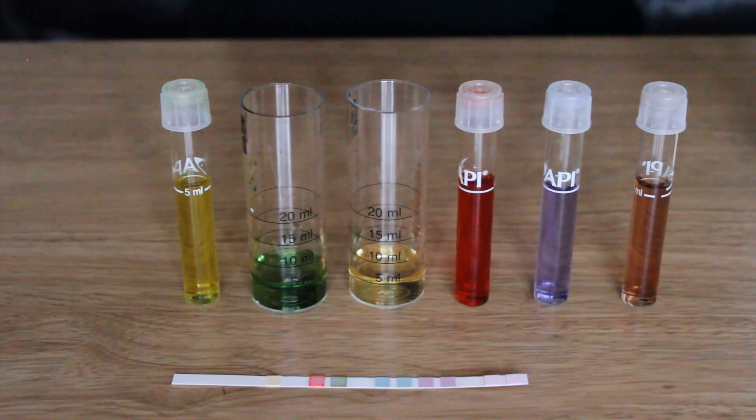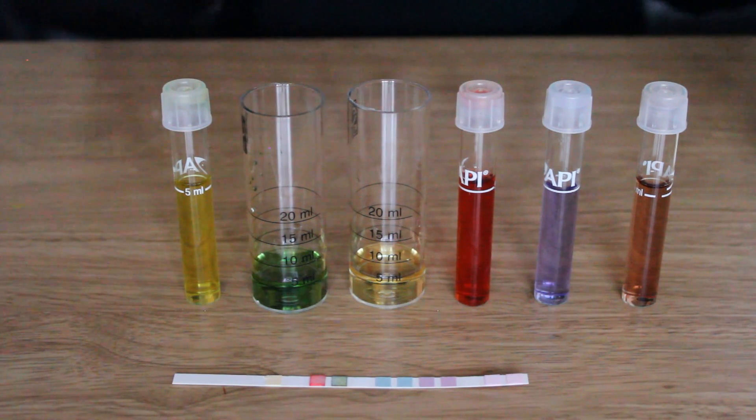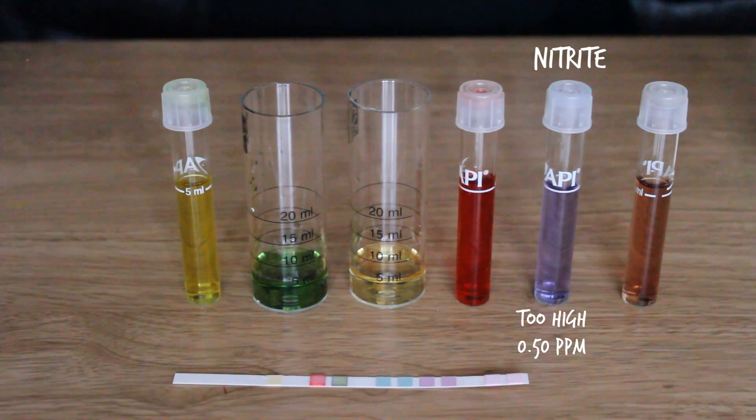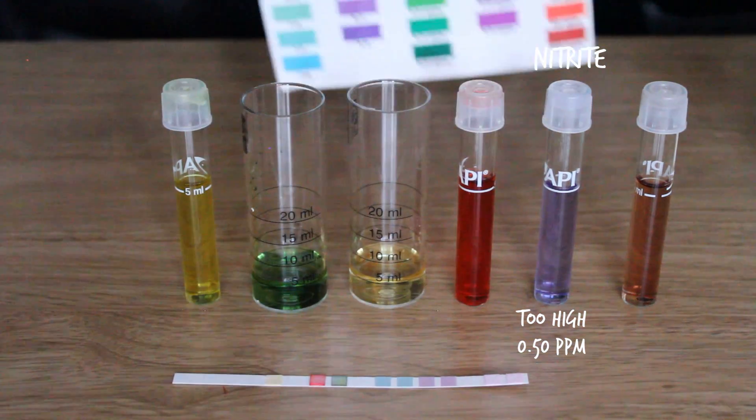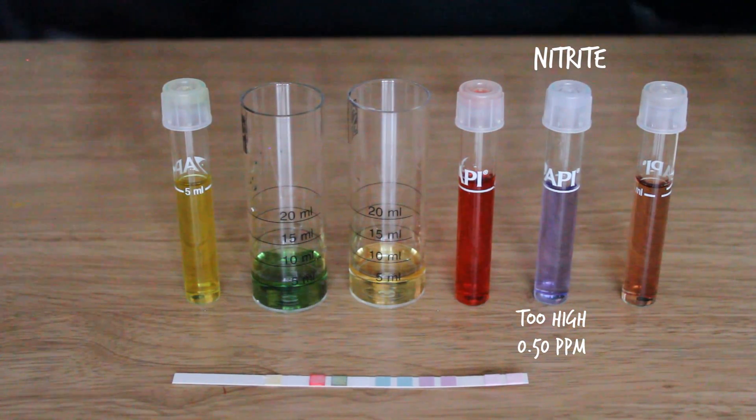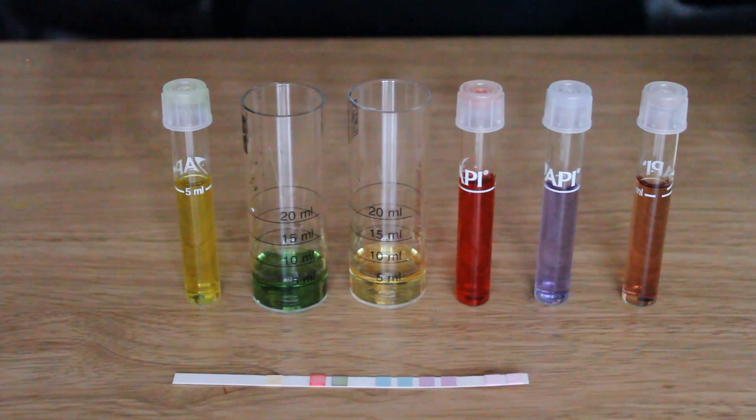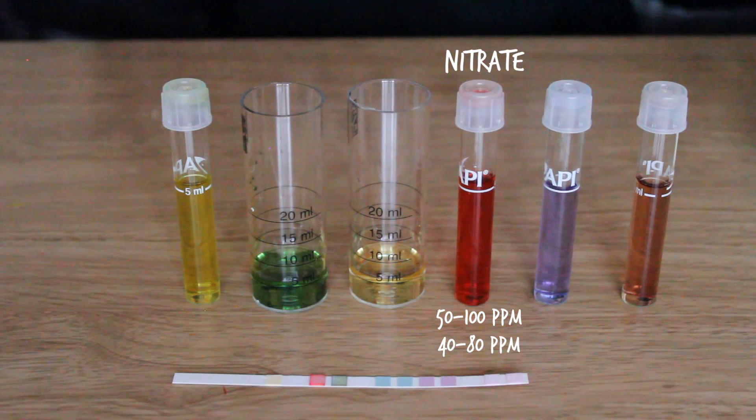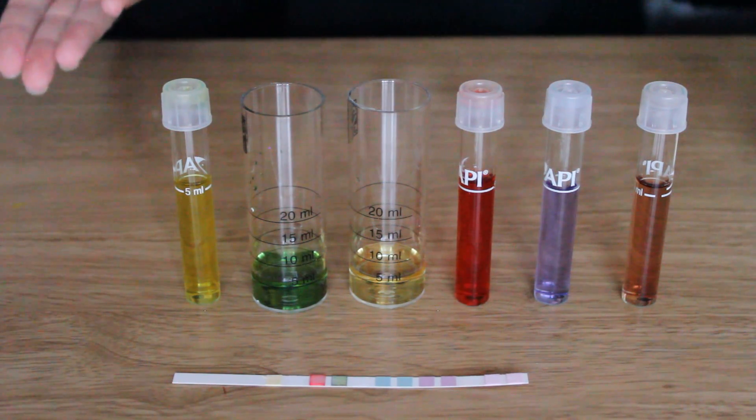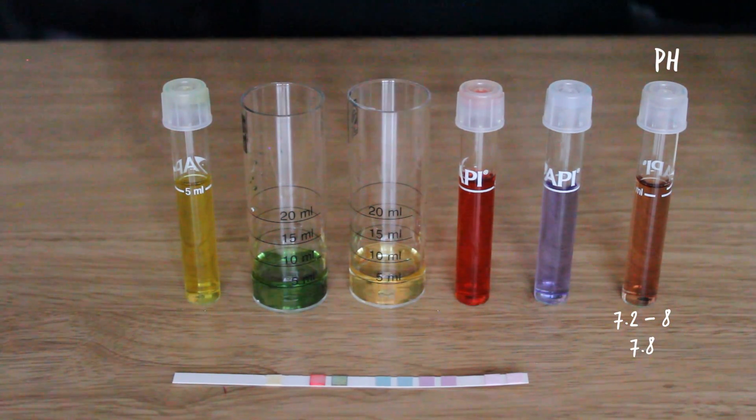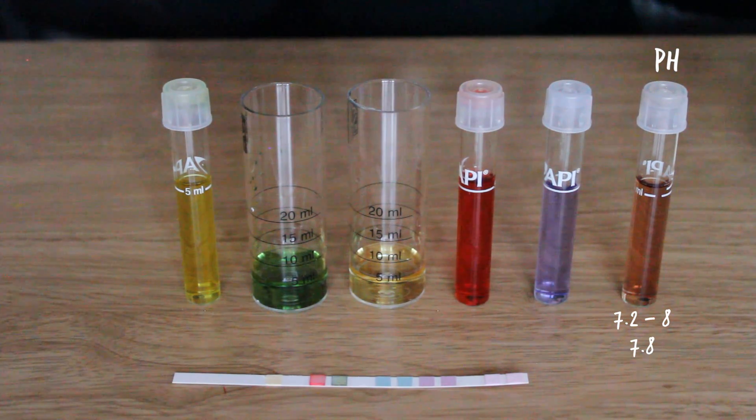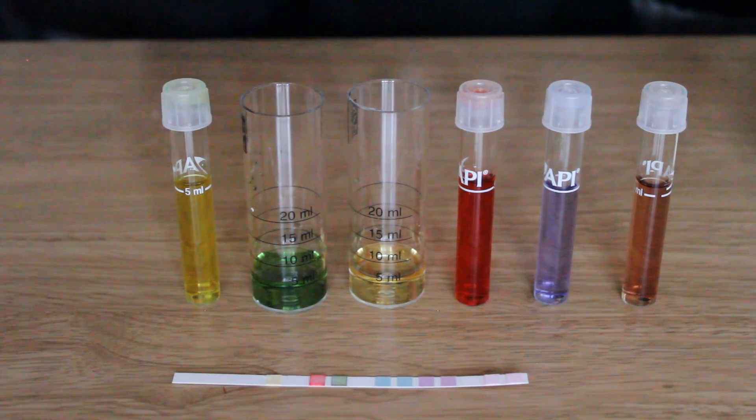If we compare what we got from the test strip to all of the other results they pretty much seem on point. The nitrite it said was too high, from the actual tester kit it was sort of midway. The nitrate on the test strip said 50 to 100 and we got 40 to 80, so once again in the same region. pH they said 7.2 to 8 and we got about 7.8. Ammonia we did not test on the test strip.